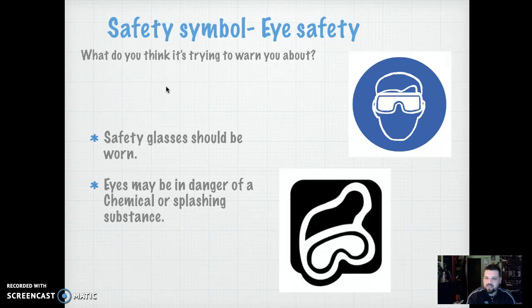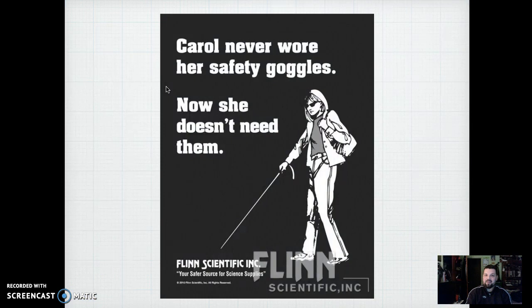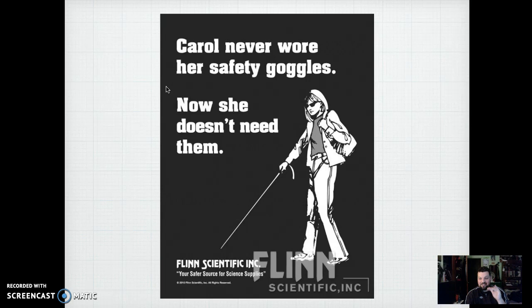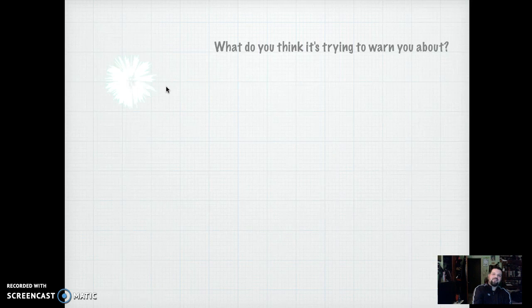This is a really famous poster. I know it's really morbid, but when you read it, it says: 'Carol never wore her safety goggles. Now she doesn't need them.' I actually have this poster, and whenever kids read it they stare at it. I always tell them this is a really old, famous poster with a really serious tone. In other words — wear your goggles. Wear them. That's what that poster is.